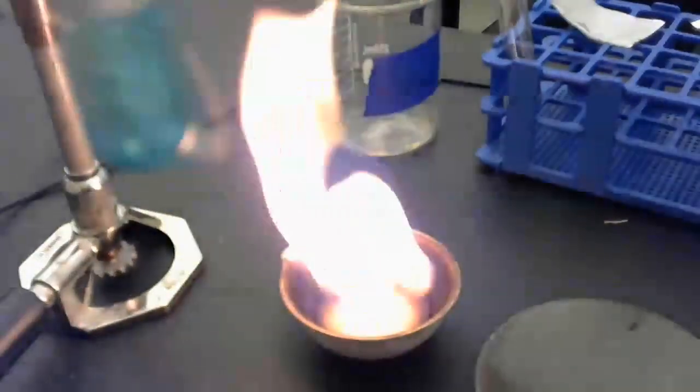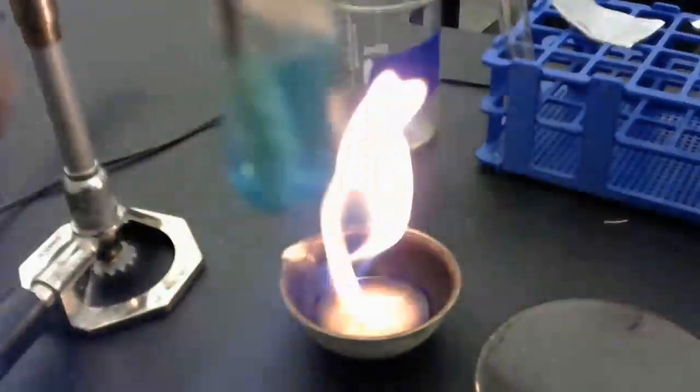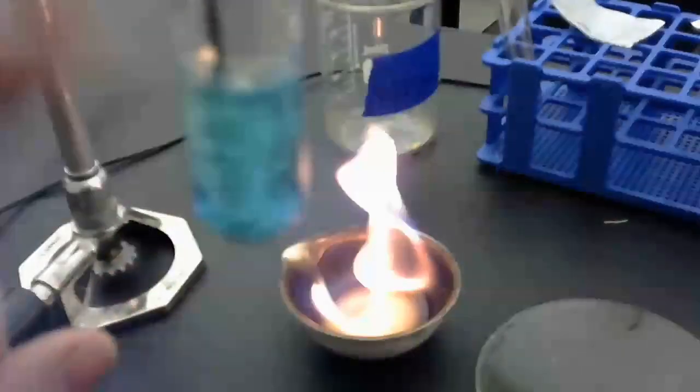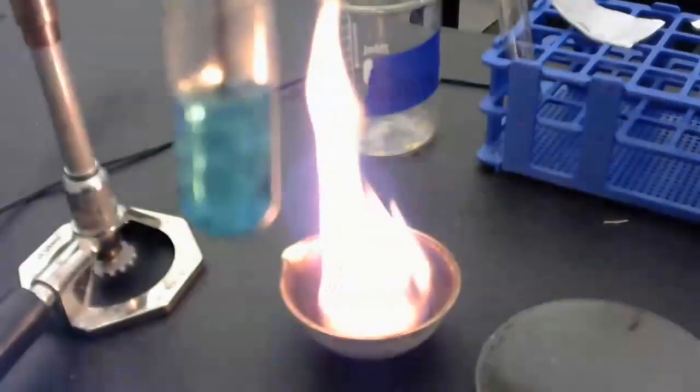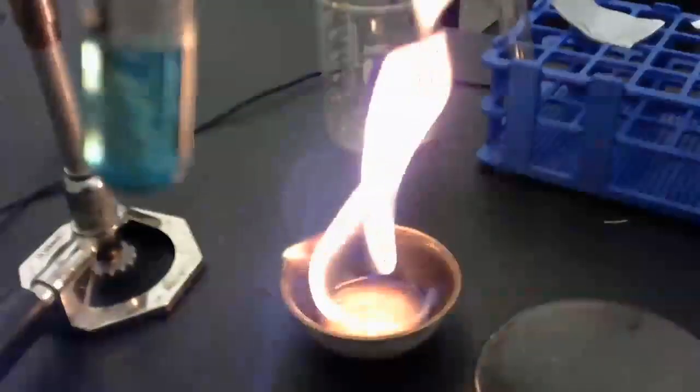And I can tap it on the bottom, and when I tap it, those pieces start to flake off of the copper, to fall onto the bottom of that test tube. Pretty cool, if you ask me.